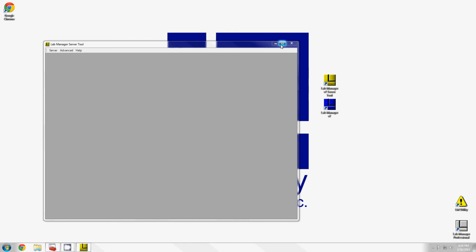So we typically recommend that you've got some space on your hard drive, or if you're going to do backups routinely, maybe back up on an external hard drive, a network hard drive, or just keep an eye on the backups themselves. Once you have a Friday backup, you really don't need the Monday through Thursday backups. You can delete those if you want. Same thing if you want to keep maybe the end of the month backups. At the end of each month, you can keep those and then delete all the other ones. That's fine too.